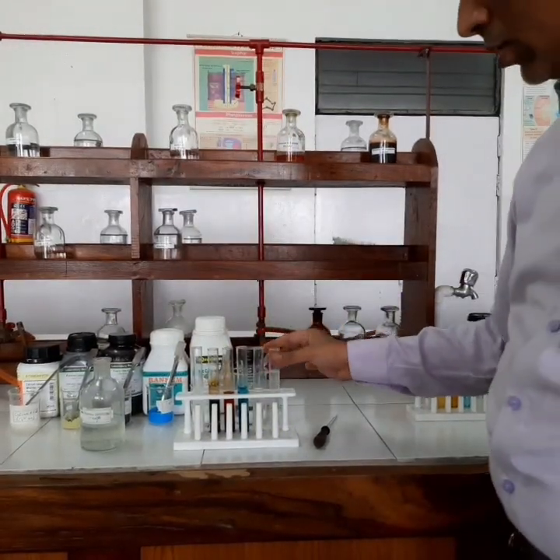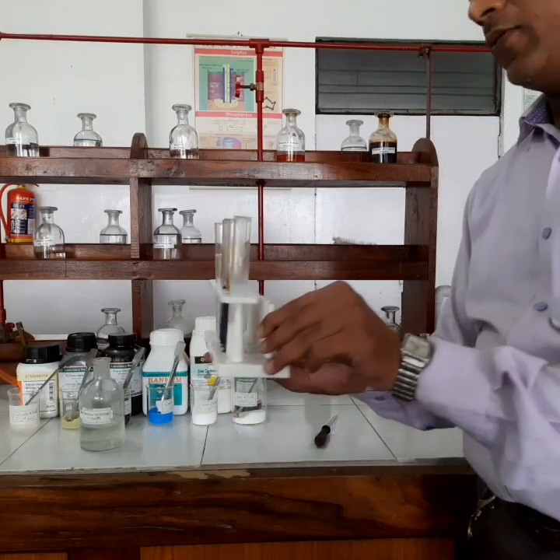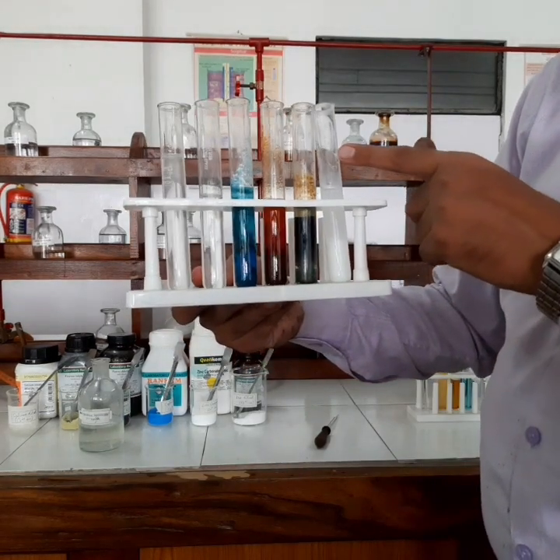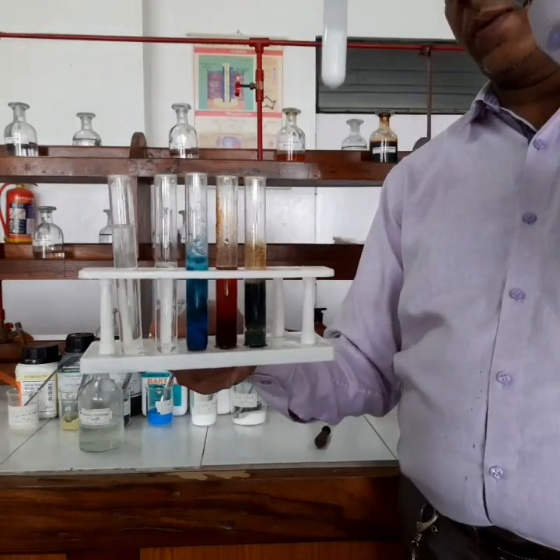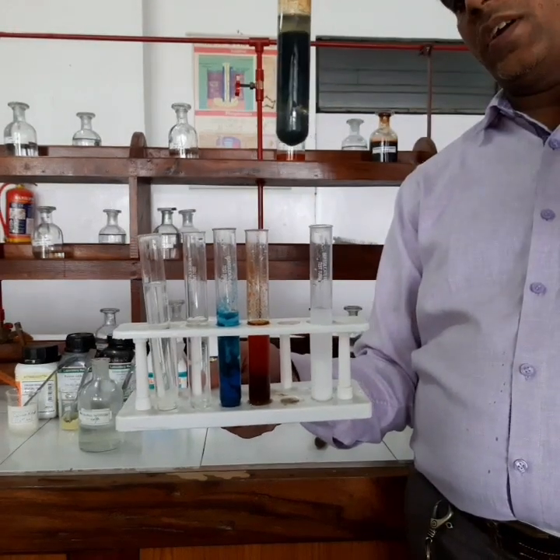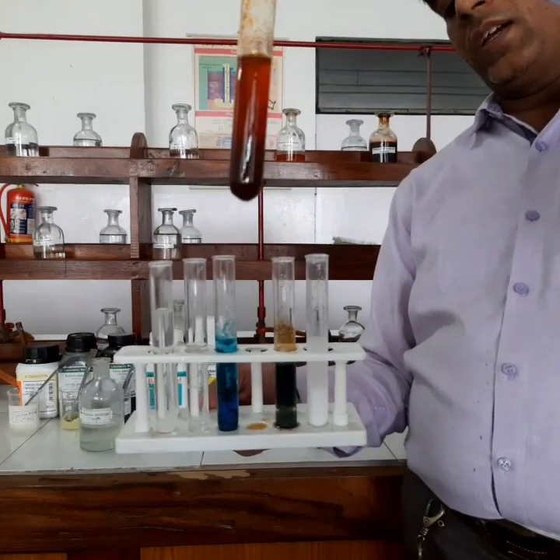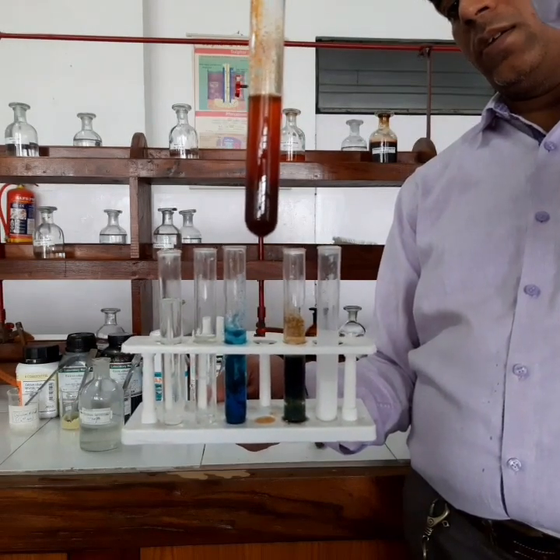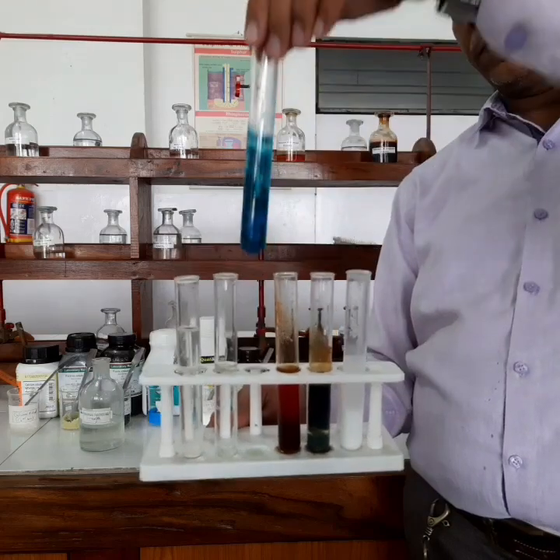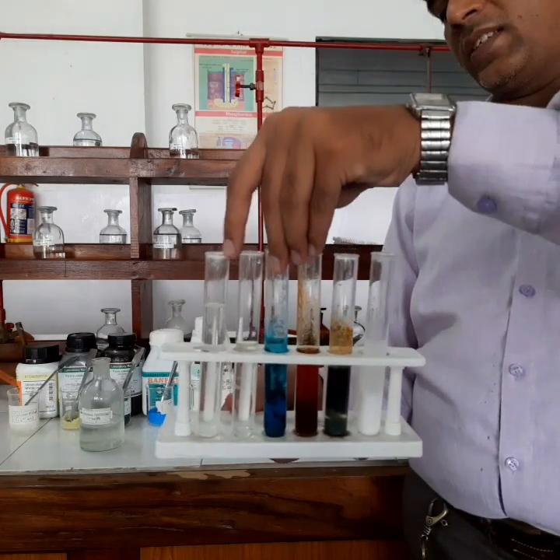So this is what is going to happen when you are going to test for these cations like calcium, ferrous, ferric, copper, zinc and lead. As you have seen, calcium is forming a milky white precipitate, insoluble in excess. Ferrous is forming a dirty green precipitate, insoluble in excess of NaOH. Ferric is forming a reddish brown precipitate of ferric hydroxide, which is also insoluble in excess. Copper forms a pale blue precipitate, again insoluble in excess.